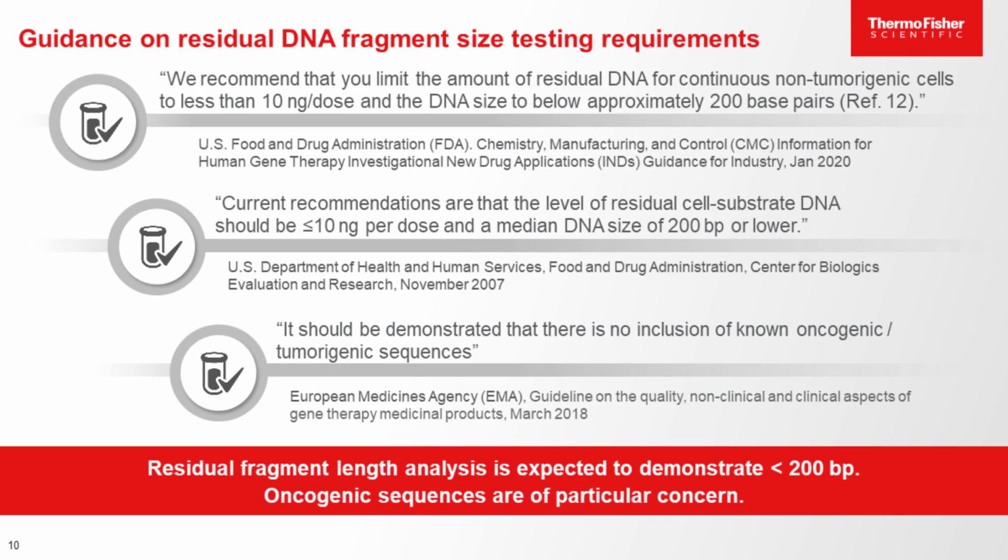The FDA echoes the same guidelines and also emphasizes that host cell DNA content is kept as low as possible and that manufacturers are using a highly sensitive method to determine DNA levels. In traditional biologics production, meeting regulatory guidance on limits has not been a significant problem. DNA clearance is well established and characterized. But in viral vector production, this has become of increasing concern, primarily due to the potential encapsulation of the residual DNA in the final product.